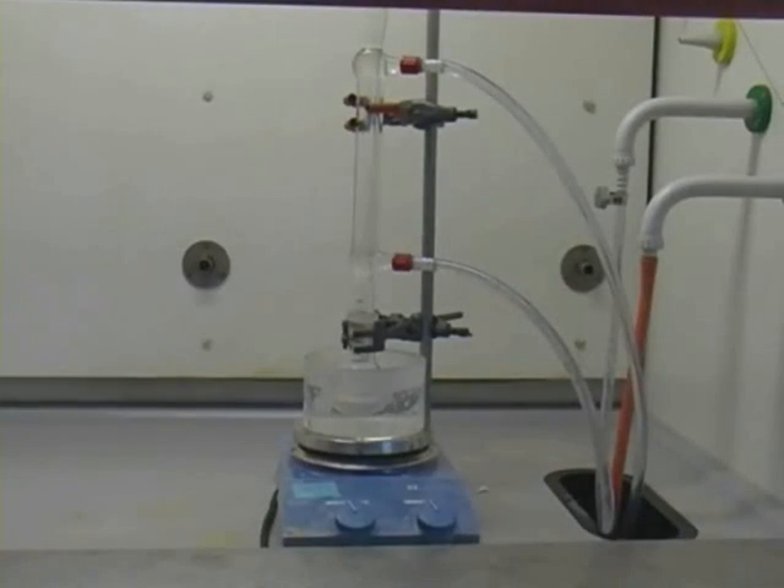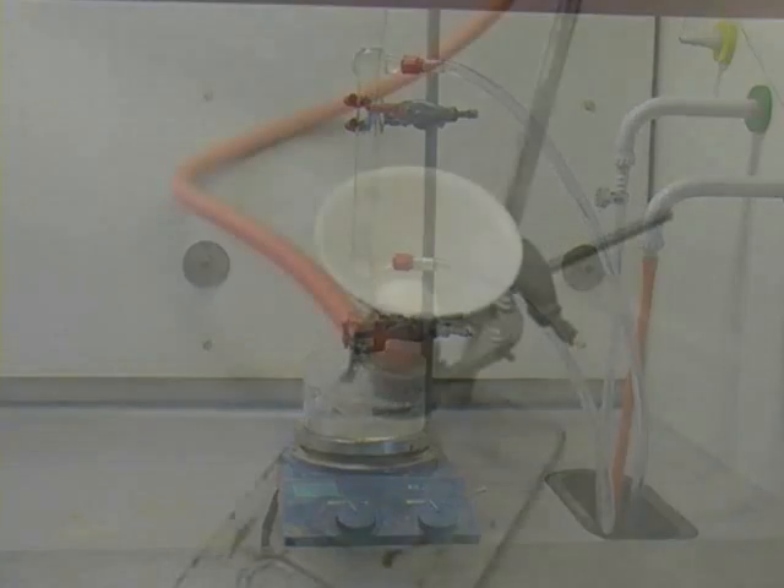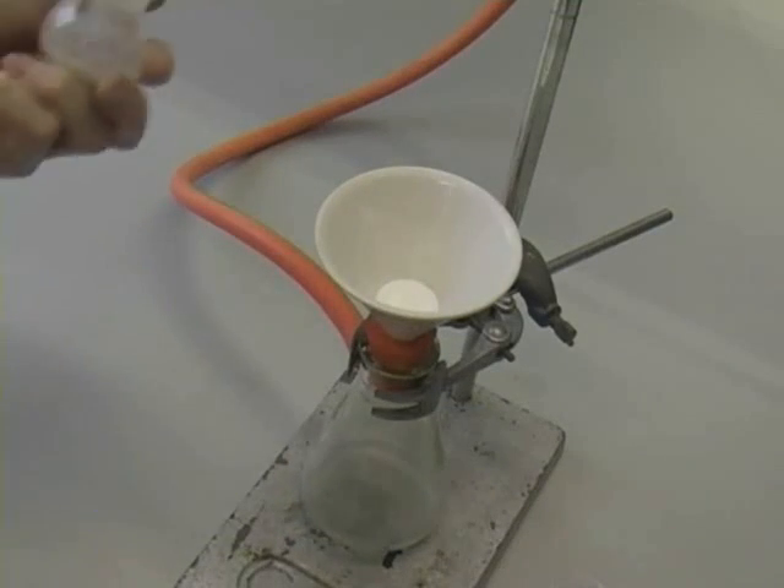Reflux in a water bath for 20 minutes, then allow to cool and filter through a Hirsch funnel.